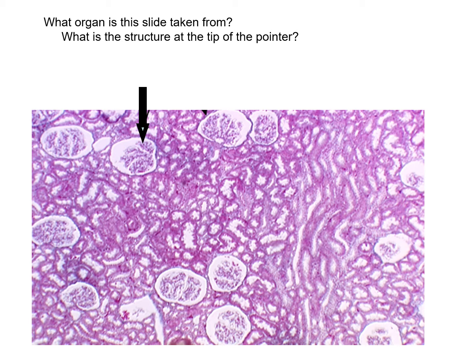Kidney. It is the kidney. And what is at the pointer? Glomerulus? It is. Good job.